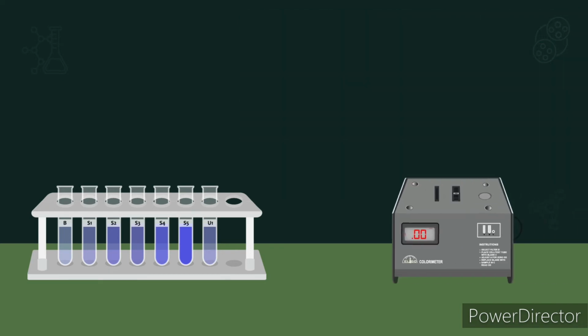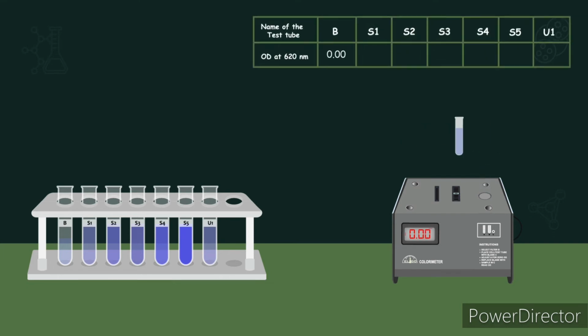After estimation of protein at 620 nanometer, we are going to find out the specific activity of salivary amylase.